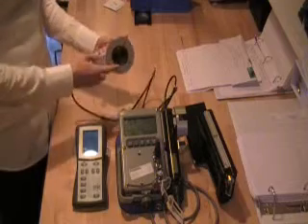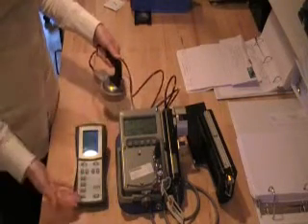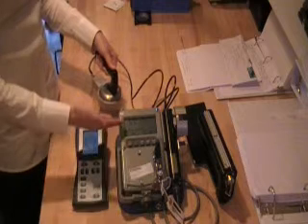And again, it's based on this transducer-based proximity locator that works with our training control unit to automatically update count rates based on distances and send that information to a real meter for readout on the display.